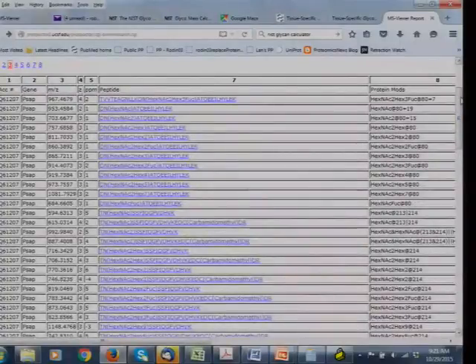But the answer to your question is that from the software you're going to get this very big summary report. The peptides will be listed by protein, and you can sort it and say, I want it listed by start residue or something like that. All of the different versions of that peptide will be grouped together in a report. So you'll have a list where for one particular N-glycosylation site all the different versions are together, and below that you may have other glycosylation sites in the same protein in another group, and then you go on to the next protein.